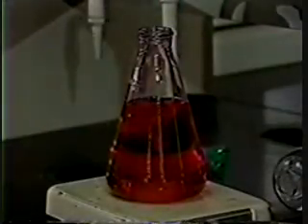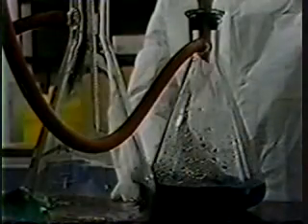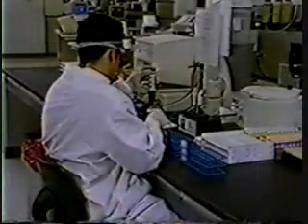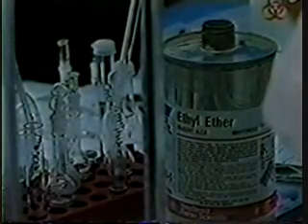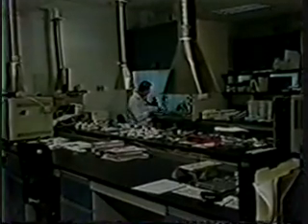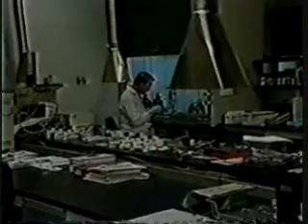Hundreds of chemicals are used in the laboratory. Acids, bases, and alkalis. Reagents, catalysts, and neutralizers. Solvents, cleansers, and disinfectants. Even though we generally use these chemicals in small amounts, we must remember that many of them can still be hazardous to our health or safety. And because most labs make use of a large variety of chemicals, we can face a variety of potential hazards.